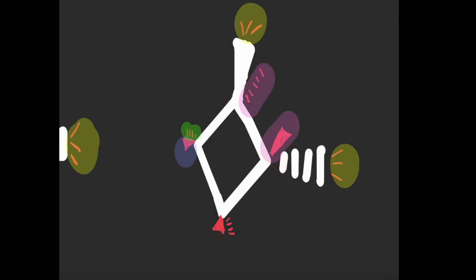So that's going to be a green signal. And this wedge down hydrogen sees the carbon close and the hydrogen far, in the same way that this one did. So this is going to be the same signal as that other hydrogen.